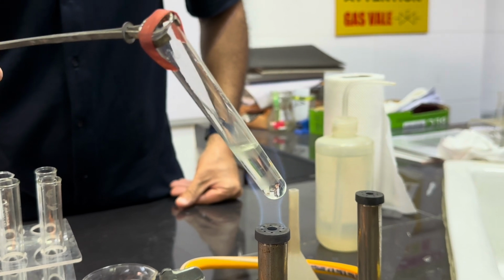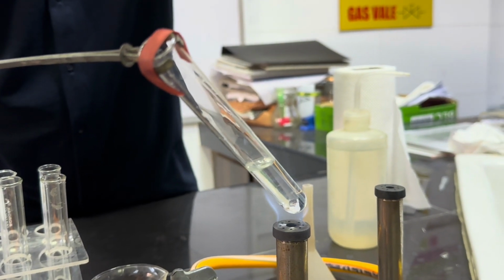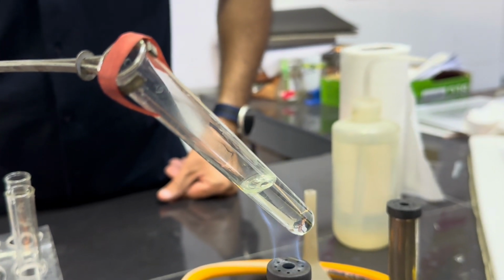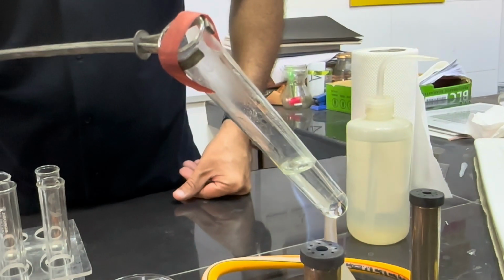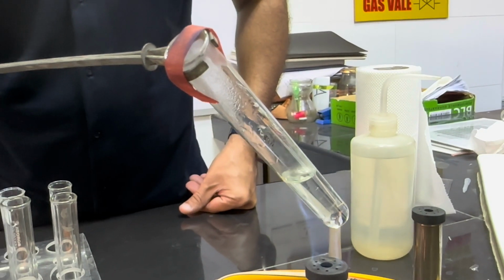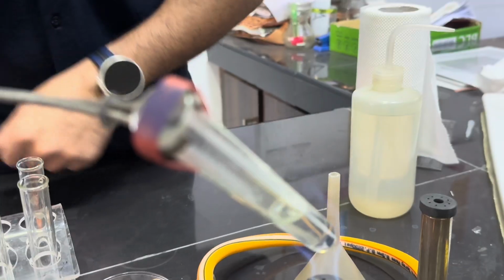Now we will look for the color change of the litmus paper from the center, the part that is exposed to the gases liberating, not the corners. Now the solution is warming and liberating gases. Bubbles are arising, and we can see the color of the litmus paper is changing and it turned blue.